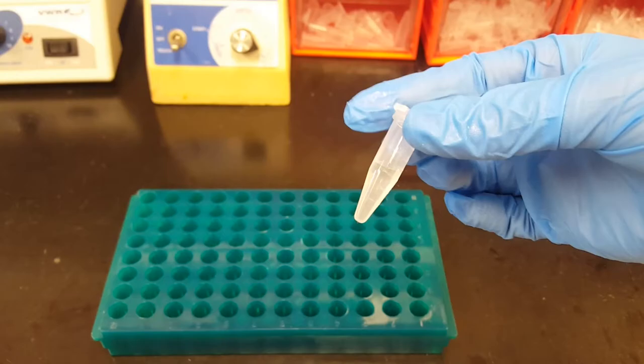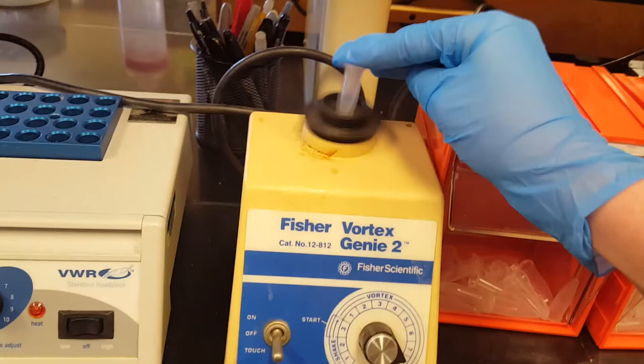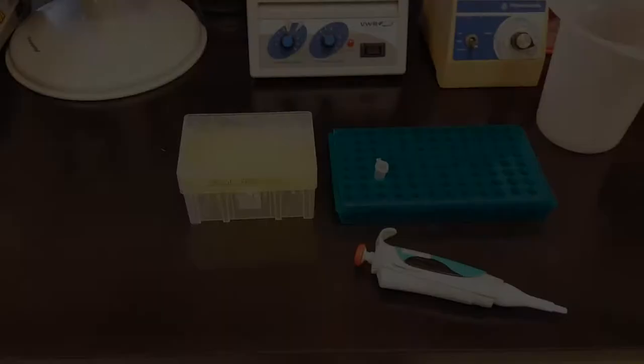If we need to mix a sample we just press the tube down on top of this vortex and it agitates the sample to mix all the contents together. Sometimes we need to heat a sample to a specific temperature, which is when we use the heat block. When we turn it on we can put the tube into this plate in the center and that plate will heat up to whatever temperature we set it at.